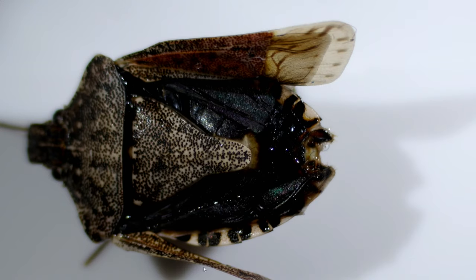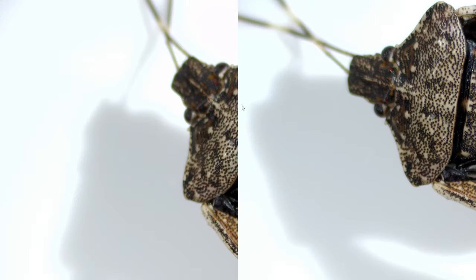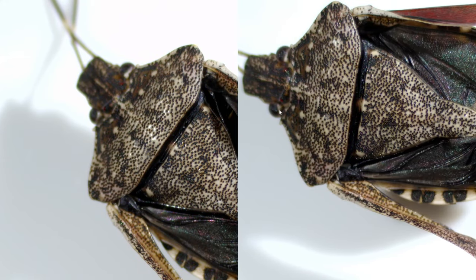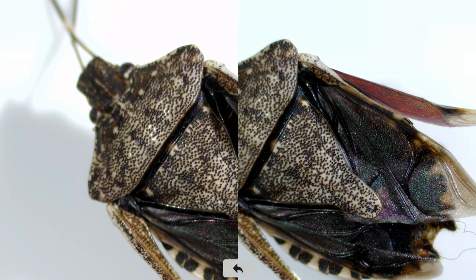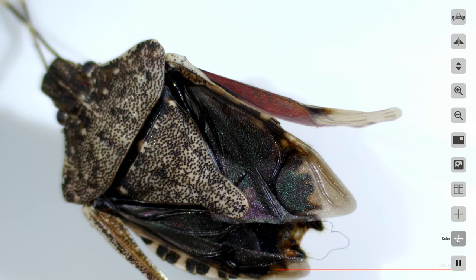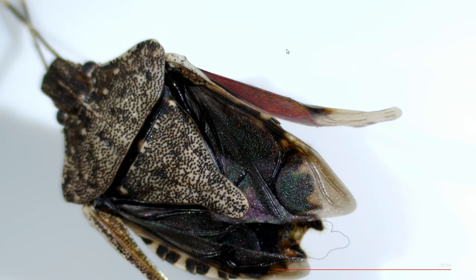If I'd like to delete anything from the jump drive, I can use the X on the right-hand side — it will prompt me to click OK to make sure I really want to delete that image. Below that we have a comparison feature, so now I'm imaging on the right-hand side the live image from the microscope, and on the left-hand side is an image that I've previously captured. There's also a cross line, a ruler, and a freeze feature.